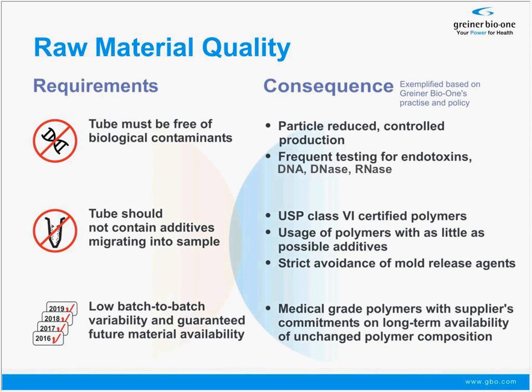So after this chapter, I want to dive into a bit of different matter, which is raw material, additives, and cleanliness of your tubes and your sample. I put together some requirements here on the left-hand side, and some consequences which are, I think, worth being addressed and known.